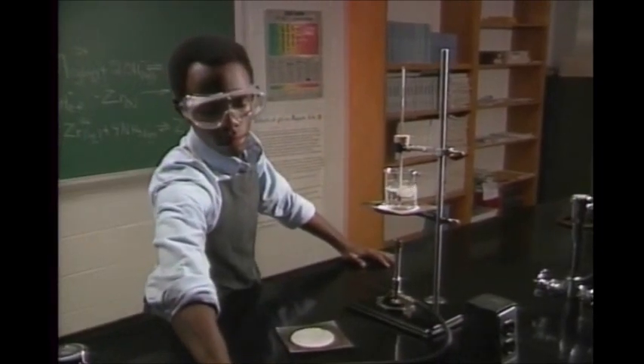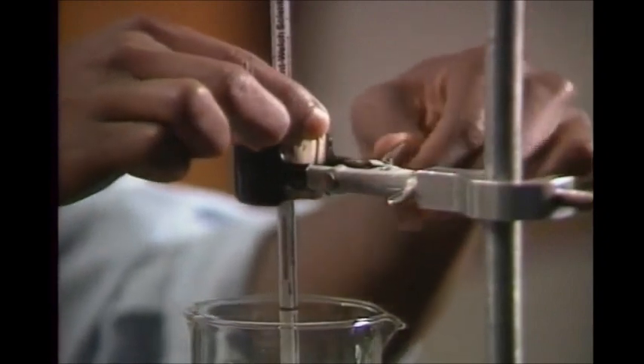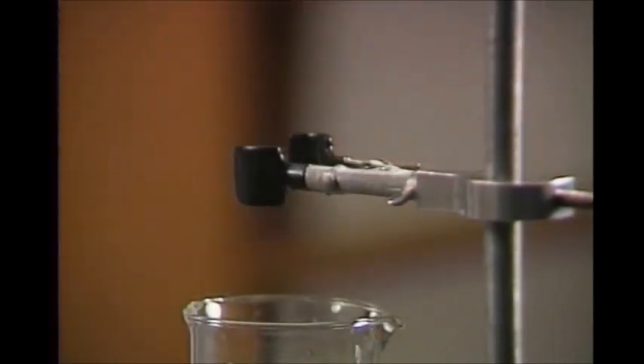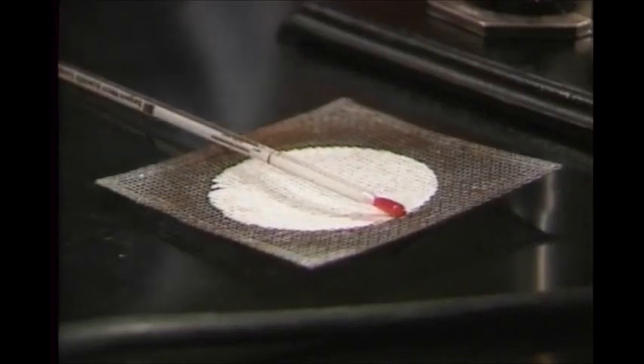No matter which type you use, always treat it carefully. When you're finished with it, set it down where it will be safe. Lay it away from the edge of the bench on a wire screen or towel so it can't roll off.